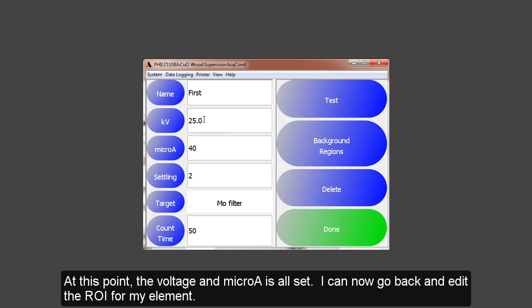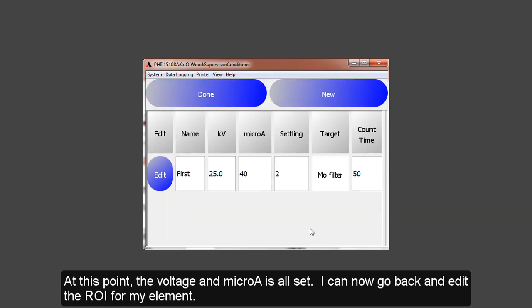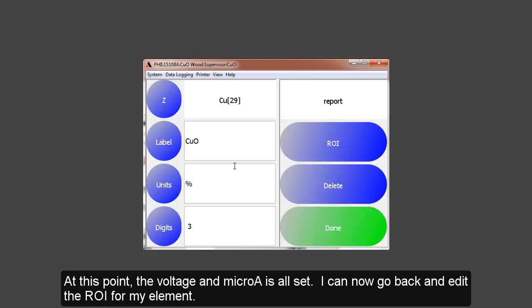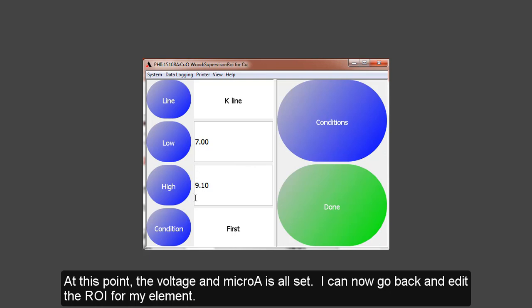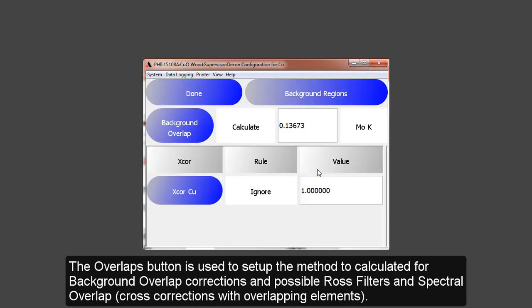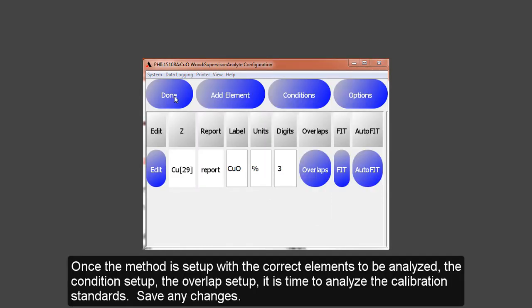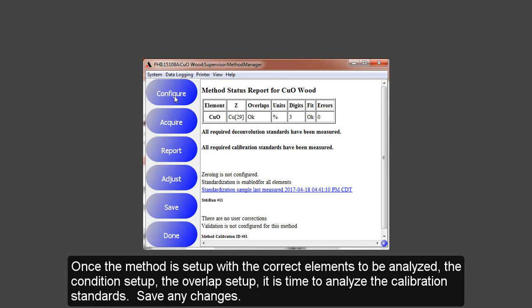At this point, I have my voltage and current all set up. Then I can go back to my elements and put those regions in for my copper settings if I need to change them. The Overlap button is used to set up the method to calculate for background overlap corrections and possible ROS filter interference, and spectral overlap or cross-corrections with overlapping elements. Once the method is set up with the correct elements to be analyzed, the conditions set up, the overlap selected, it is time to analyze the calibration standards.